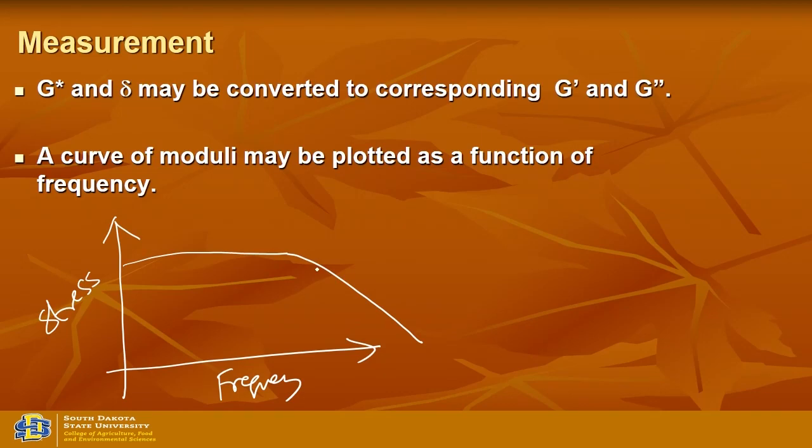When you have the stress like this, this is where you are trying to find out the linear viscoelastic region. When you have a constant stress coming out, that shows the linear viscoelastic region. When stress is declining, then you are going into the non-linear viscoelastic region. You want to do all your tests within this linear viscoelastic region.